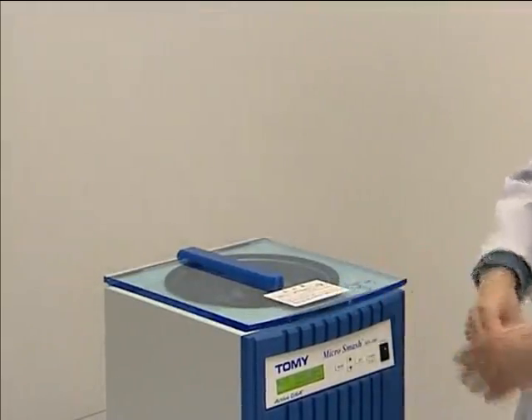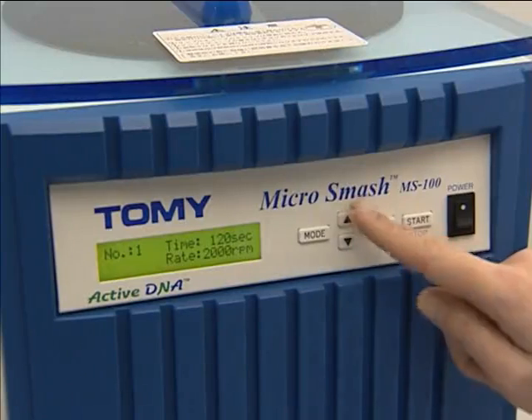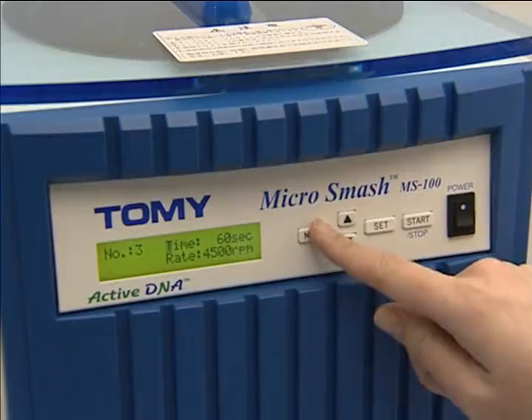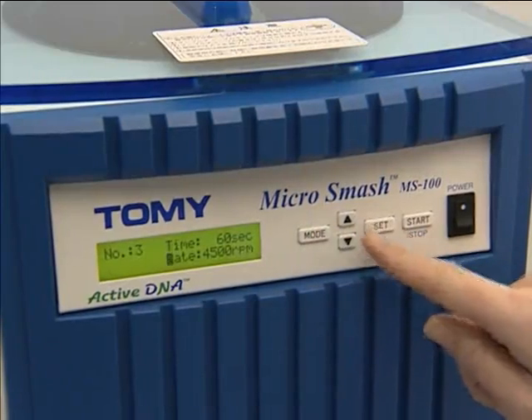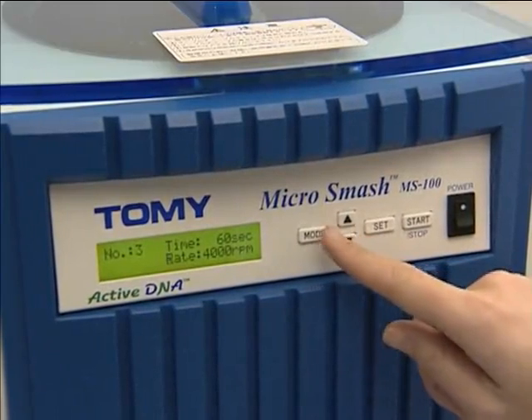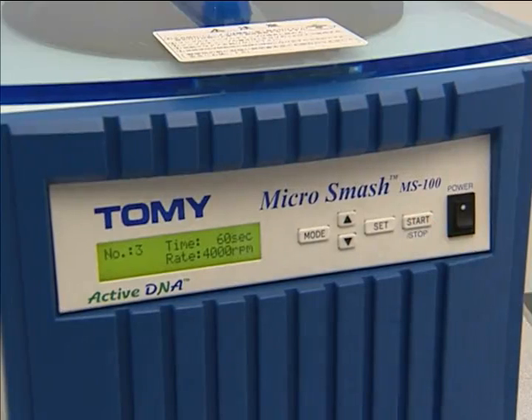The MicroSmash MS100 can accommodate up to 12 sample micro tubes and process them simultaneously with its compact size. Close the lid and select the desired operating settings. The rotation speed can be set from 2000 to a maximum of 5500 RPM. The memory setting function makes routine work easy and simple.